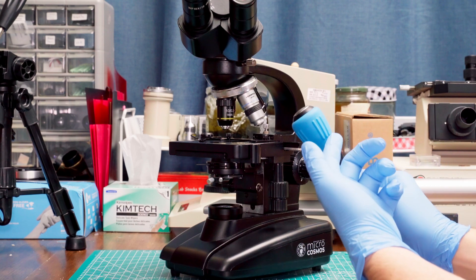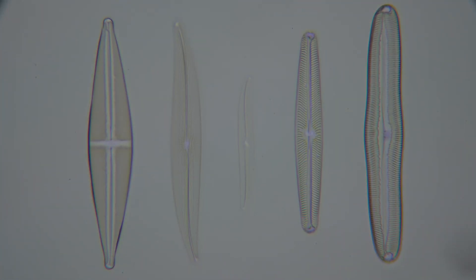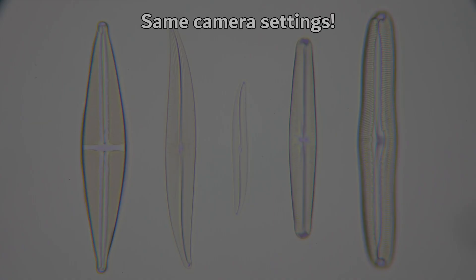It doesn't have to match the color of your gloves, but it couldn't hurt. Once realigned, you might find that your peak brightness doubles or even more. This one really seems like a no-brainer. Let's get started.